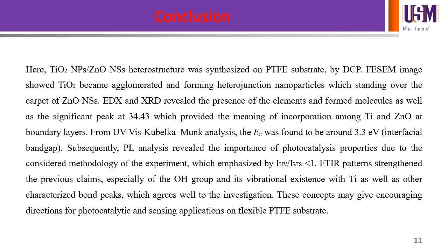The OH group, hydroxyl group, and its vibrational presence with titanium as well as other defined bonds, shoulders, peaks, which coincide with the earlier statements, were reinforced by the FTIR pattern.